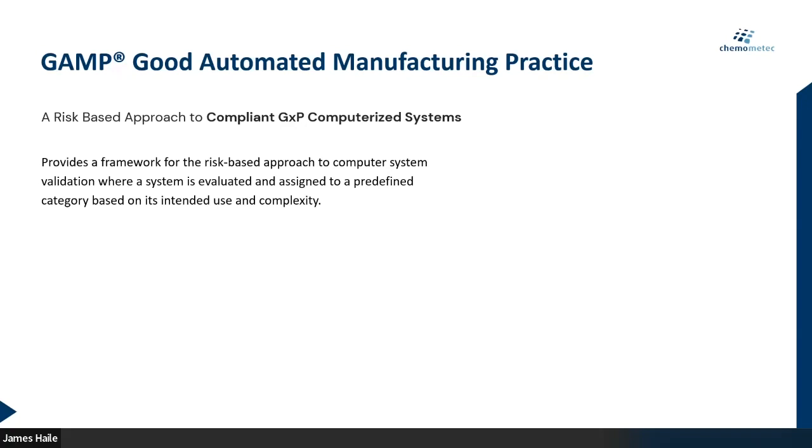categories. And then I should also promote our white paper, which is available on our webpage, which will discuss all the different points of the 21 CFR Part 11, specifically in regards to the secure mode of the NCView software, which is a software for the NC202. And then I should say thank you very much for listening and welcome questions.